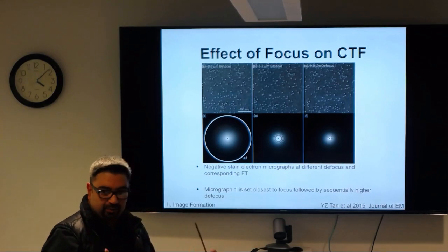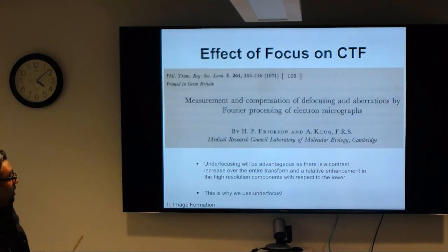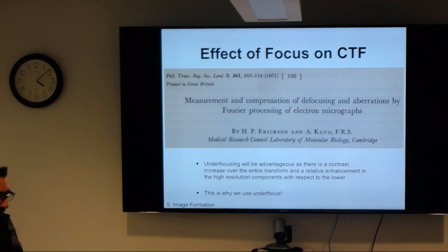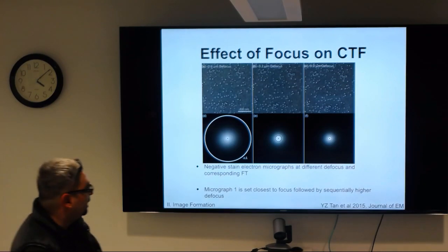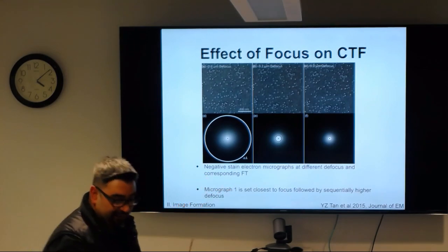And this is actually what we're looking at in the images in the micrograph. But again, to touch on negative defocus, why do we use negative defocus? Why is it something that we do to see our images? And by negative defocus, you mean underfocusing versus overfocusing. Right. And so here, based on this image, you can say that the contrast looks better.